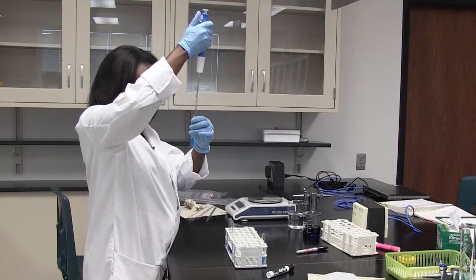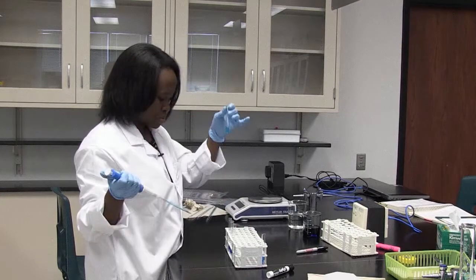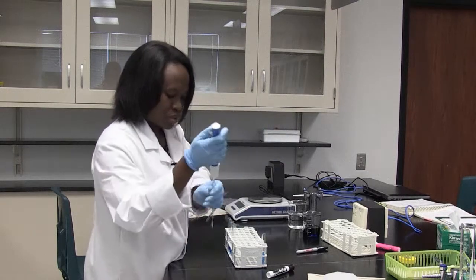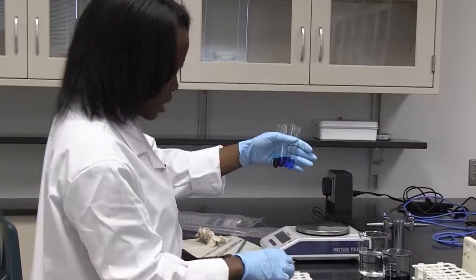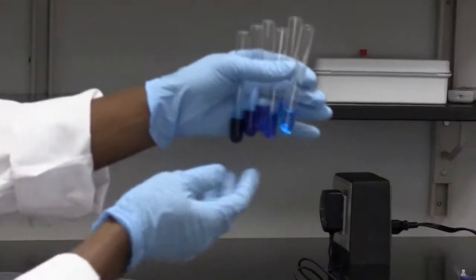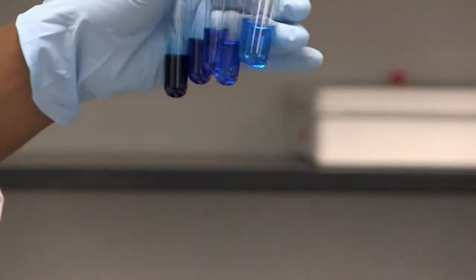In order to keep all the volumes equal, I'll just discard 1 mL of my last solution. And then when you compare all the solutions together, you will notice from left to right that the dye solution gets less concentrated. This is the stock dye, and this is the most concentrated dye.